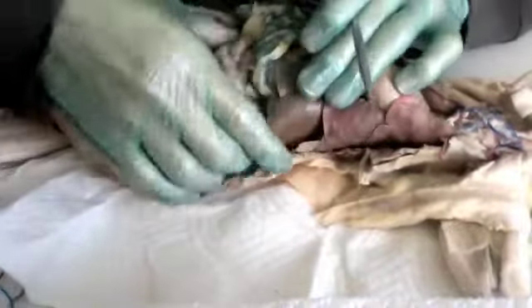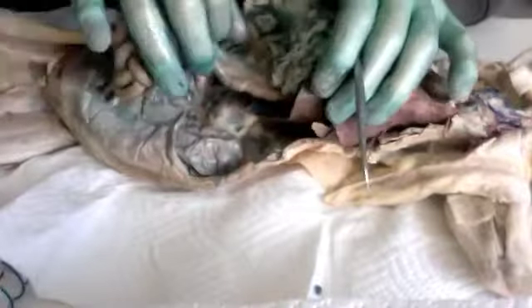And then the mesocolon, if I pull out all these intestines, it's on the back wall. This is the mesocolon. You can hear me hitting it.